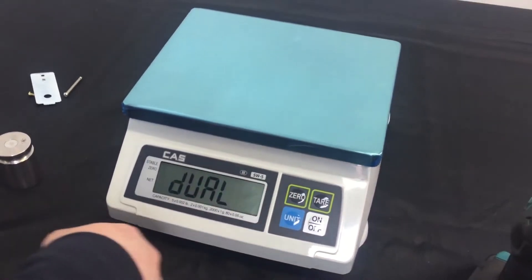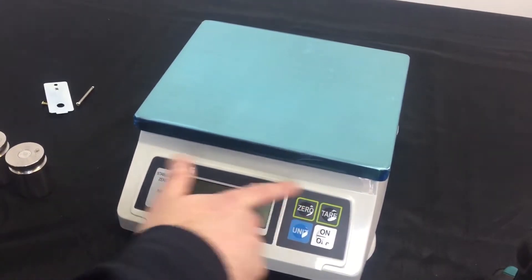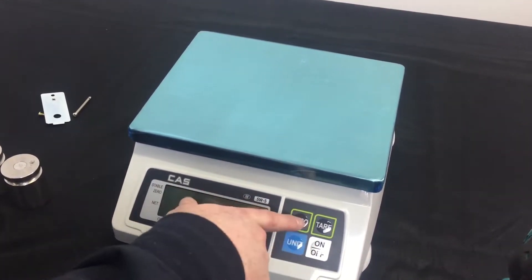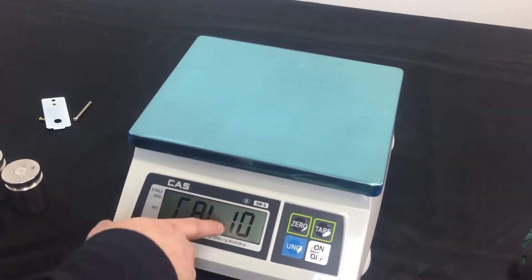So, as soon as that's good, you press the zero key. Dual. This is not a dual range scale, so zero is good. Press that tare. Not using that, so zero is good. Press zero. Back to Cal 10.